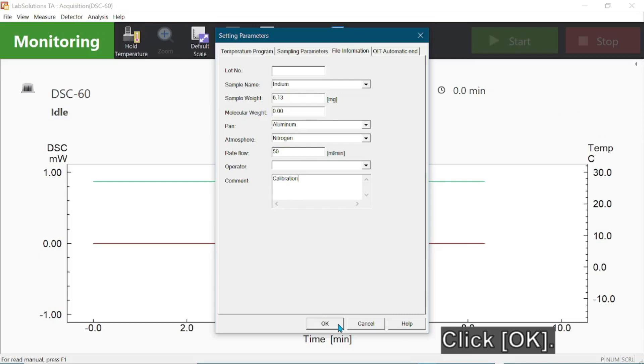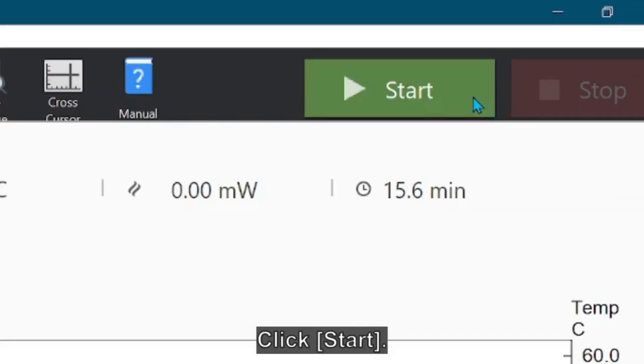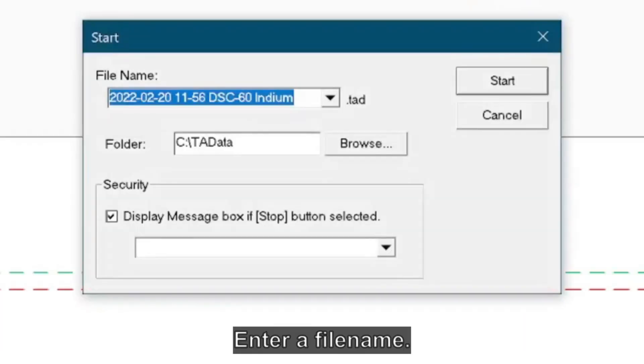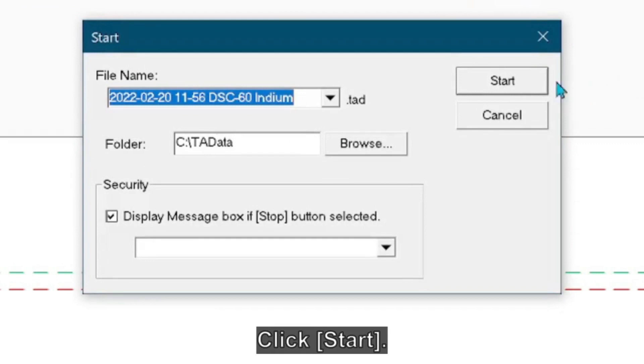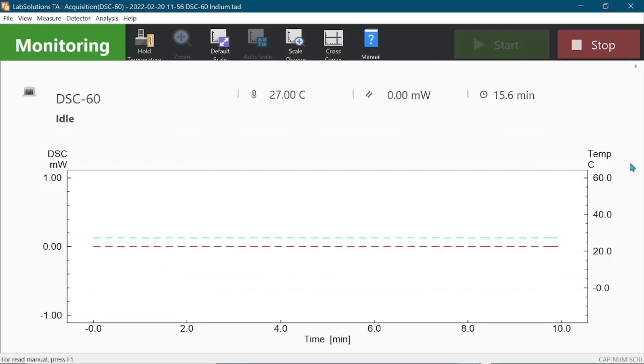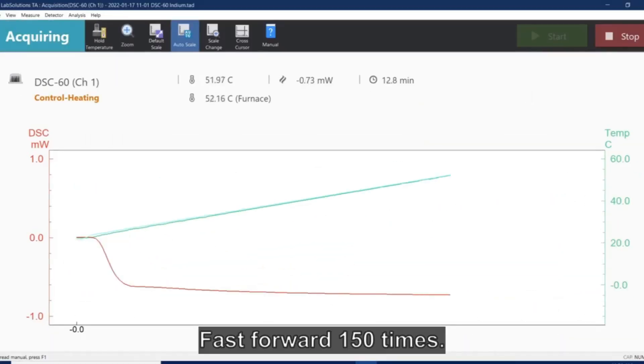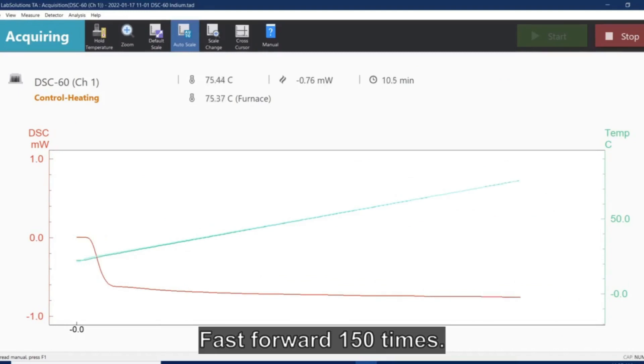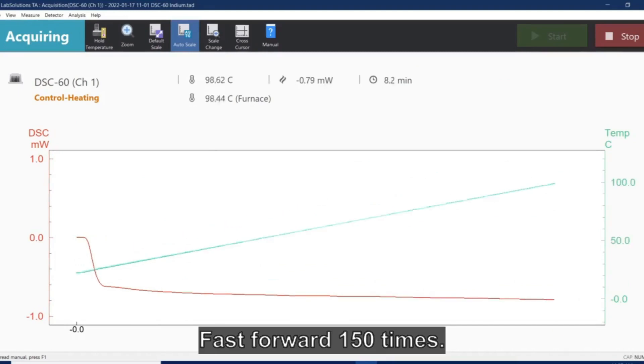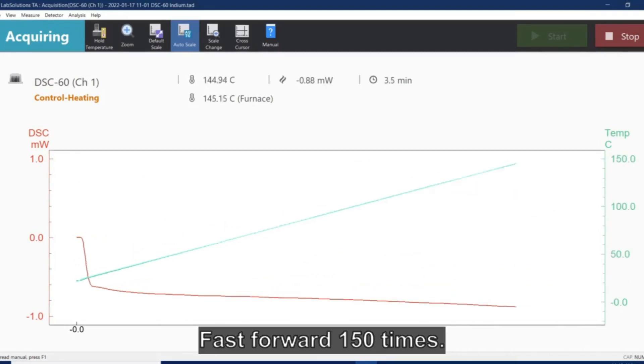Click OK to close the window. Click Start for the analysis of indium to begin. Enter a file name and click Start. A real-time DSC analysis profile for indium is shown here as an example.